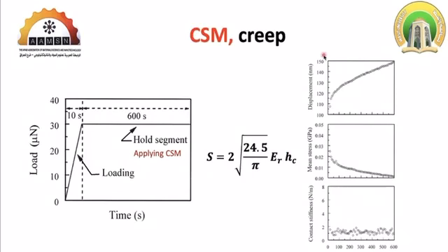Getting the results as here. Here the mean stress is the same as hardness. So what we are doing here is measuring the hardness at every single point of the holding segment and monitoring it. If there is a decrease in the hardness during the time of holding, this means that the material is time-dependently deformed, or the creep behavior of the material is well defined for this material.